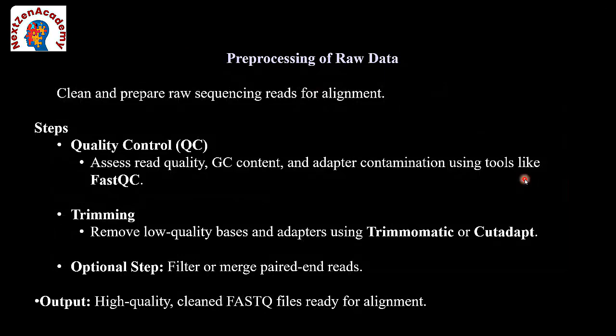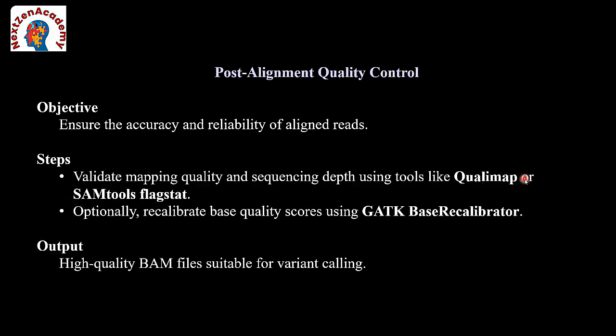So the pre-processing, as you all know how it has taken place, we need to do a quality check, we need to do the trimming process, and we need to do the alignment. And the post-alignment steps also we have done.